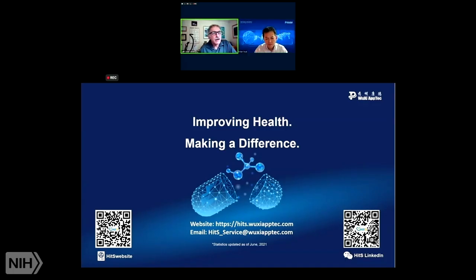Okay. There are a number of other questions. I'll read one more and then hand it back so we stay on time. And then Letian, if you could answer the rest after by typing, that would be great. Sure. So do you ever find that selection samples are difficult to PCR? For example, PCR inhibitors, how do you approach this?